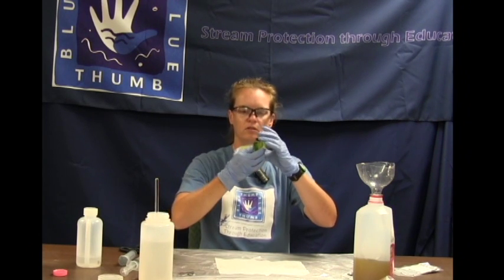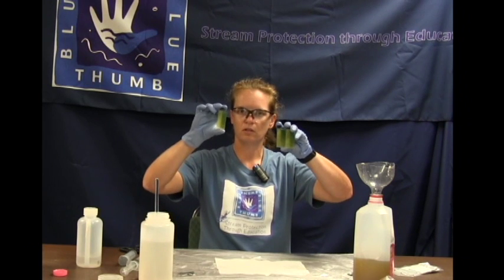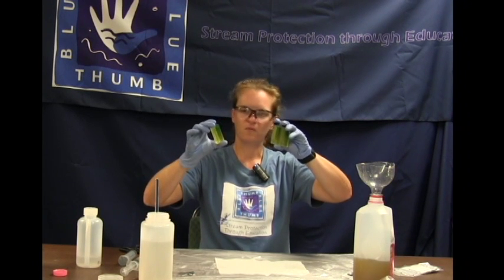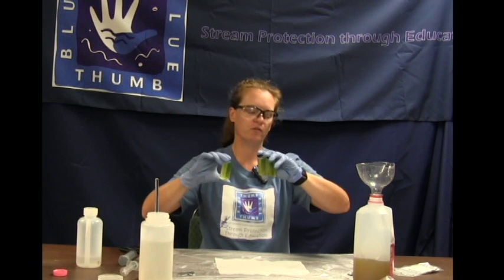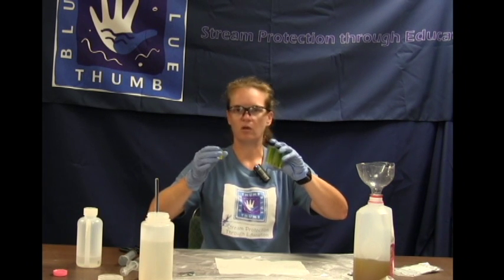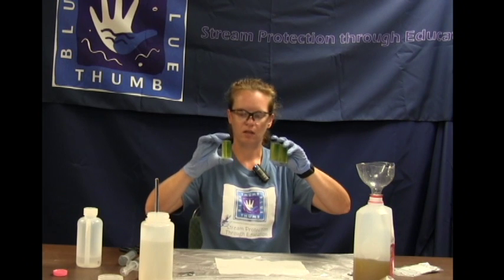Okay, when they're all dissolved, they should always start out as yellow. The blank should start out as yellow, and the 2 creek waters should also start out as yellow. If they don't start out as yellow, figure out what happened. Sometimes people have added 2 of the same reagents before. If you add them in the wrong order, if the reagents are not working properly, something's not working. Both the creek waters and the blank deionized water should always start out as yellow.